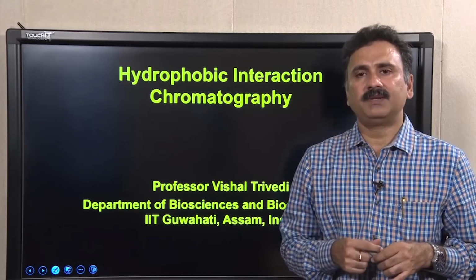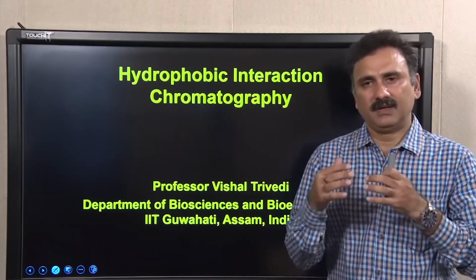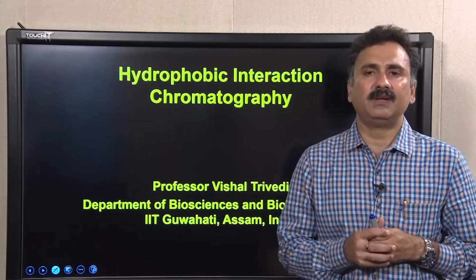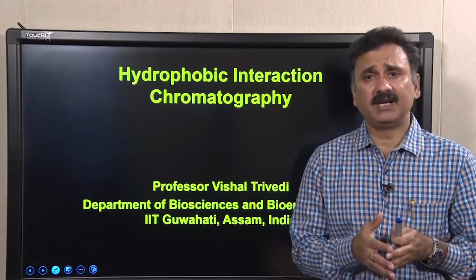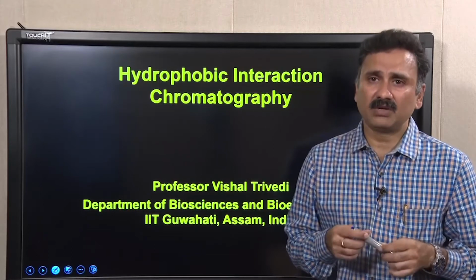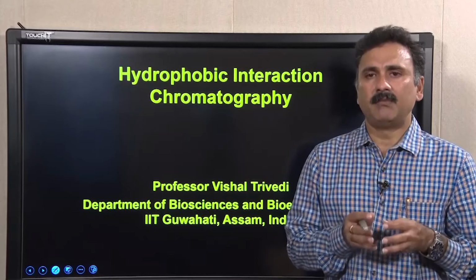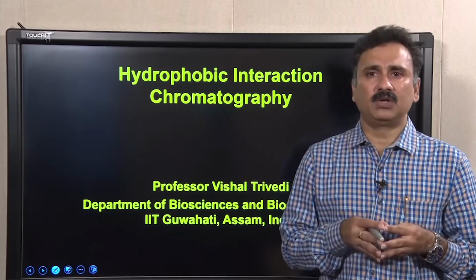And what we were discussing was chromatography. In this chromatography series, we were discussing the different chromatography techniques. In the previous lecture, we discussed ion exchange chromatography, and in today's lecture, we are going to discuss hydrophobic interaction chromatography.